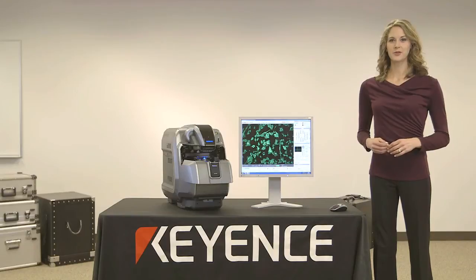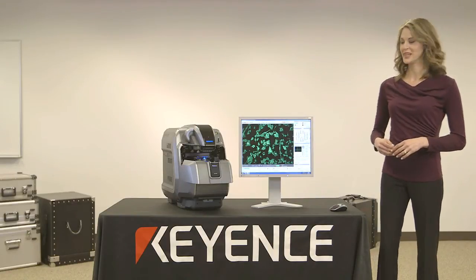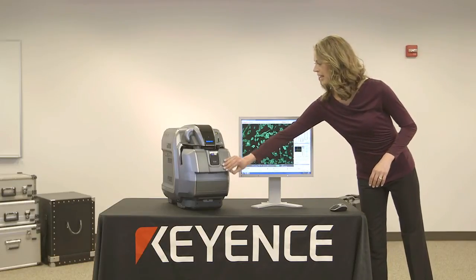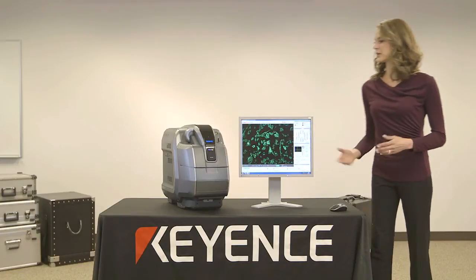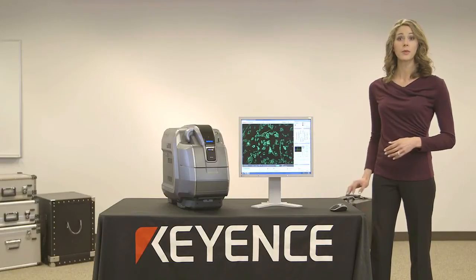Another unique feature of this microscope is that you don't have to perform fluorescence imaging in a darkroom. Just by closing this front hatch, I've created a built-in darkroom, and all of my imaging can be performed right from the benchtop.